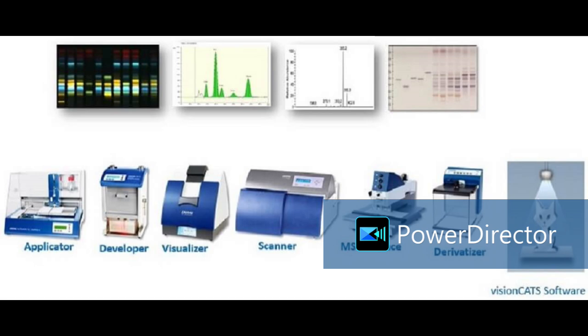Therefore, some chemicals are common in all, but some chemicals are different from species to species, based on geographical condition, cultivation time, etc. So we can compare different samples at the same time together on a single screen. By using the HPTLC fingerprint technique, we can differentiate between two samples.